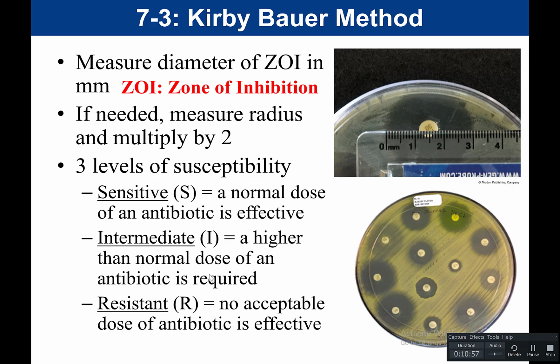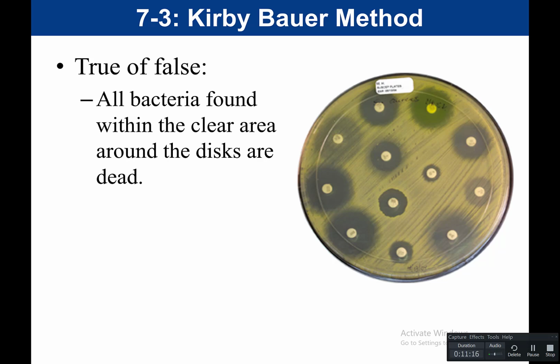And again, you would use that if the bacteria is not sensitive to any of the drugs. If your best option might be an intermediate, well, then you know that you need to give a higher than normal dose in order for this test to be effective.